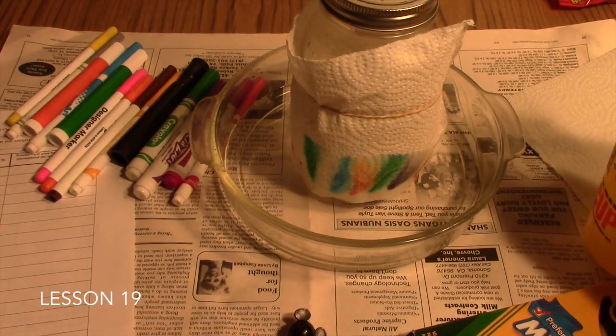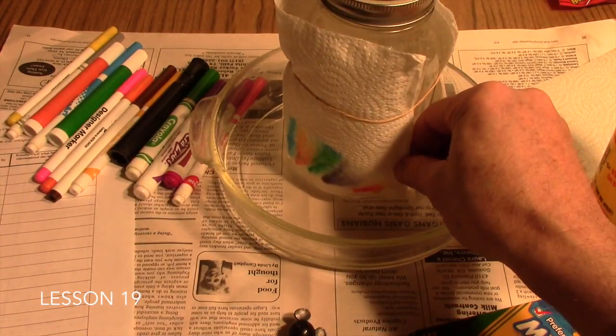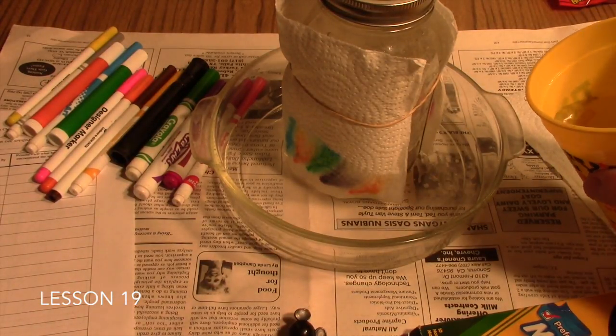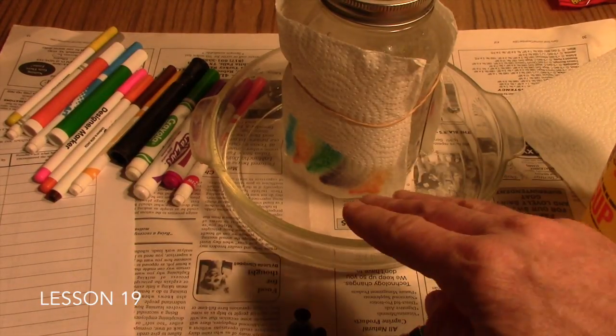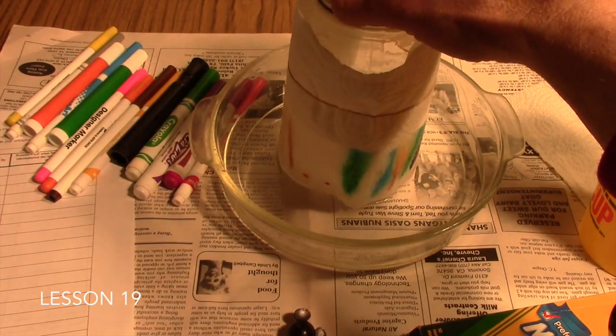I'm going to go ahead and add, looks like my paper is up out of the water on this side over here. I'm going to lower it down a little bit. There we go. And then we're going to add a little more water to it. And that allowed the water to continue to travel.